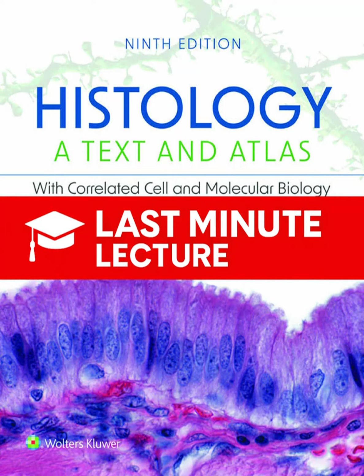Oh, yeah. We'll move pretty quickly to techniques that use electrons instead of light, like transmission and scanning electron microscopy, TEM and SEM. And then we get to explore the really cutting-edge tools. Like Atomic Force Microscopy, AFM, with its almost atomic resolution, and then the newest super resolution methods, which have, and this is amazing, literally found ways to break the fundamental physical limits of light itself.